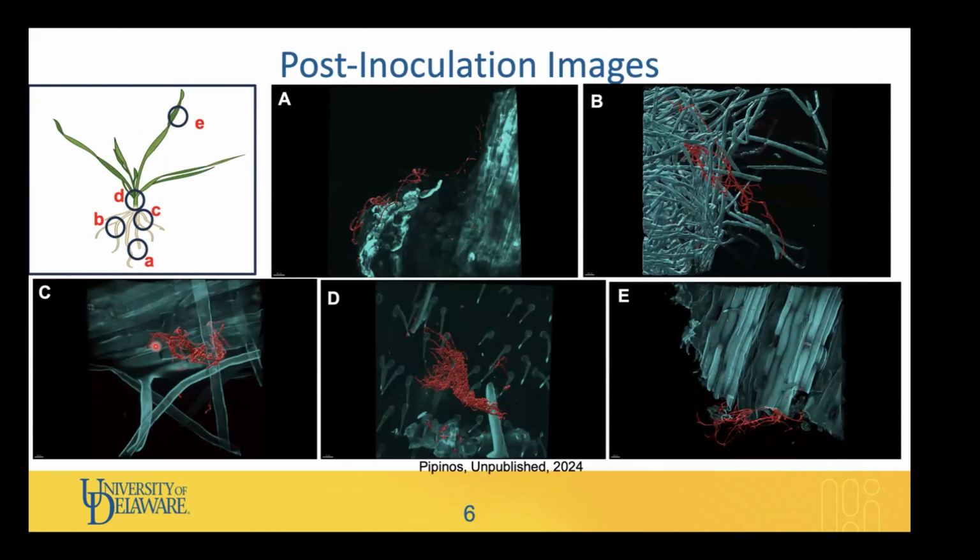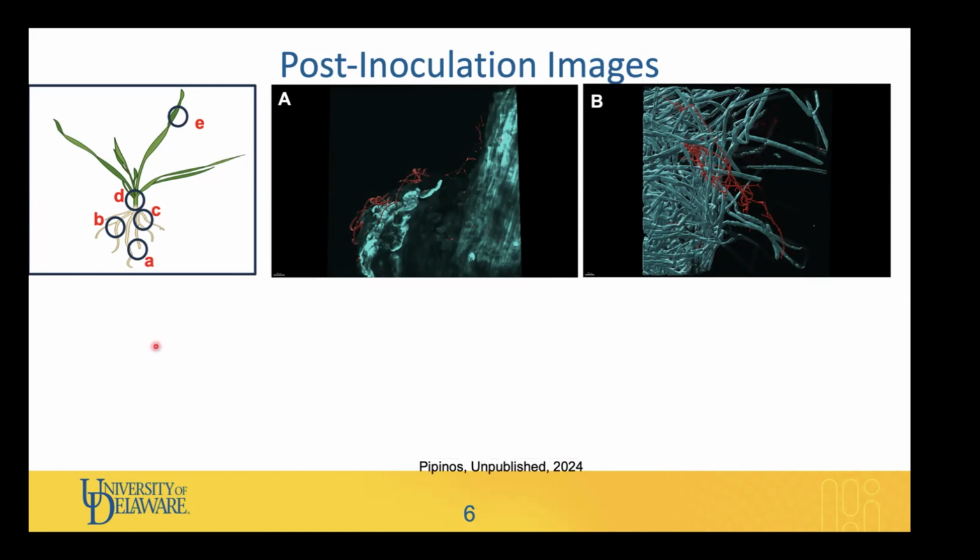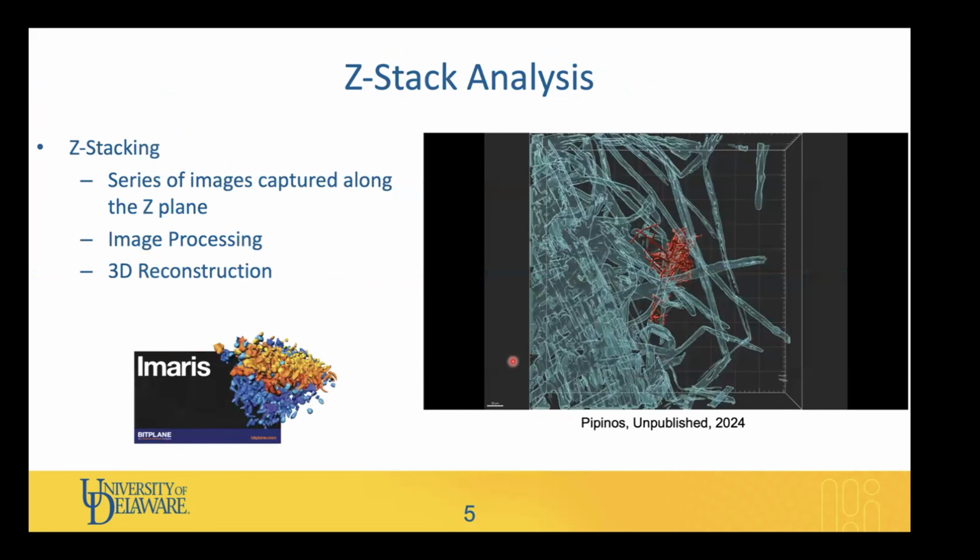Sure. So we use the super resolution microscope, so that's from the Andor Dragonfly. I know the Leica Stellaris is just a confocal microscope, and you can also do Z stacks with those. So what it'll do is I'll define one side of the Z plane and then move it towards another side of the Z plane. And then it'll take a series of thousands of images and then reconstruct it to create like a 3D image. So in this video, you can see it does look a little bit 3D.